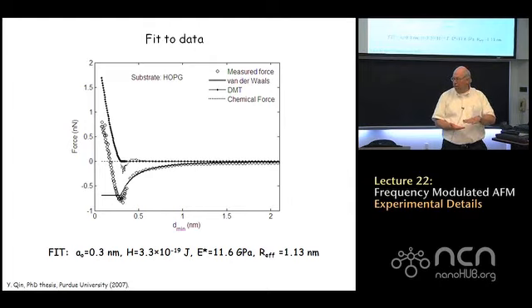And those air molecules prevent you from seeing the underlying substrate with any great precision. So if you want to make the time it takes for these molecules to readsorb back onto a surface hours rather than fractions of a second, you have to reduce the pressure to ultra-high vacuum.